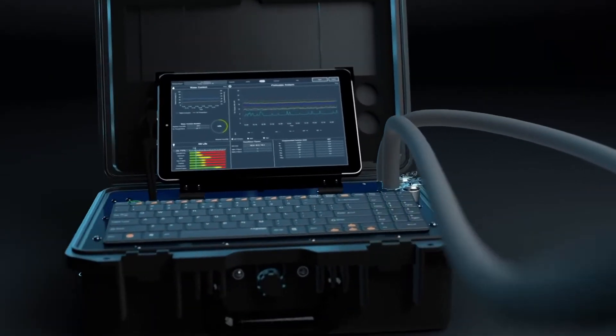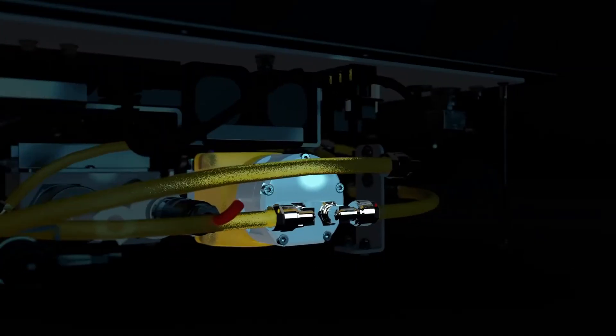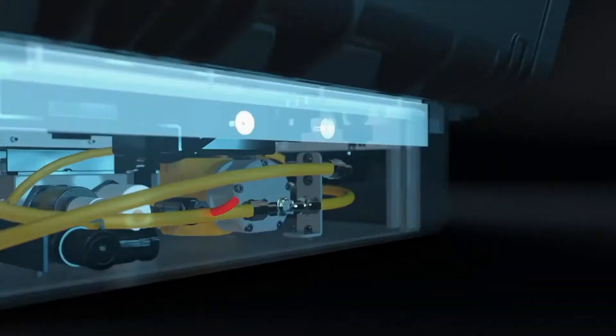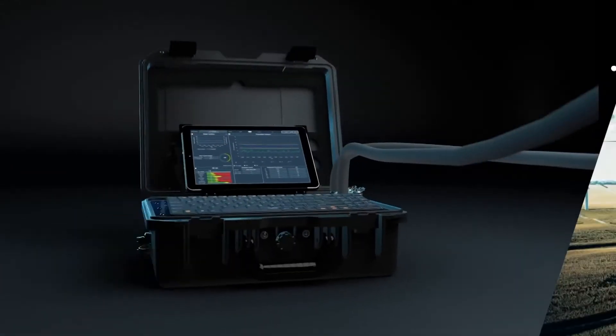Following its connection to a sample supply, the oil begins its journey through a high-torque stepper motor pump delivering precise flow rates for even the most viscous oils up to 2400 centistokes, and connection to a live system up to 350 bar.